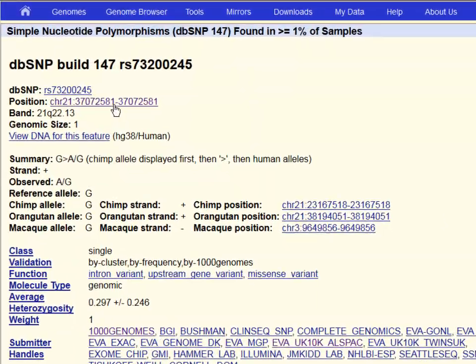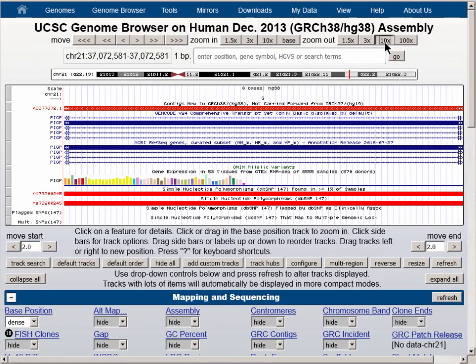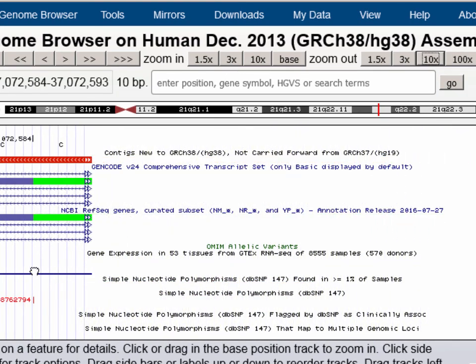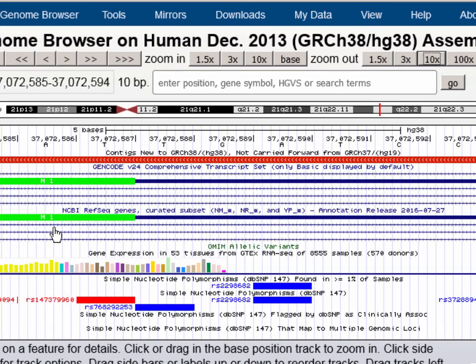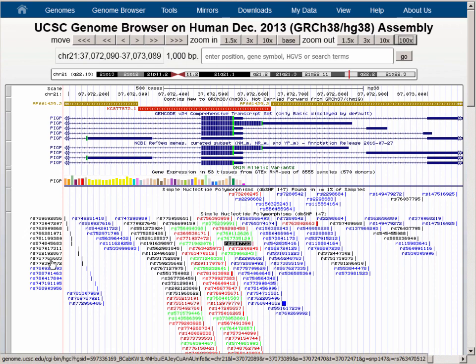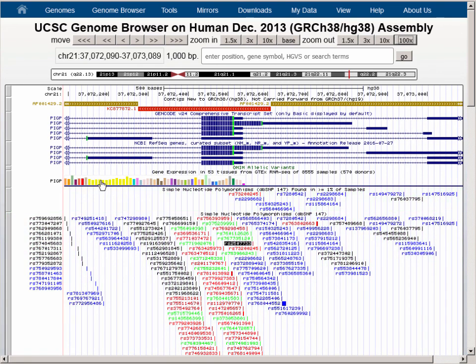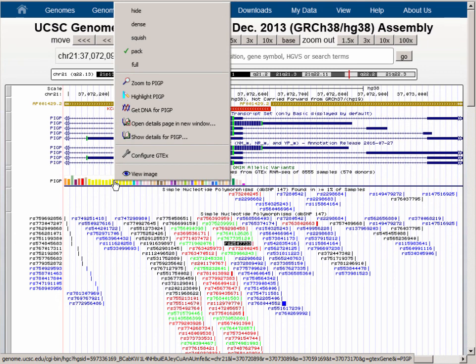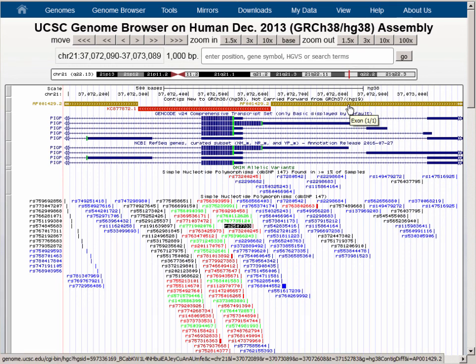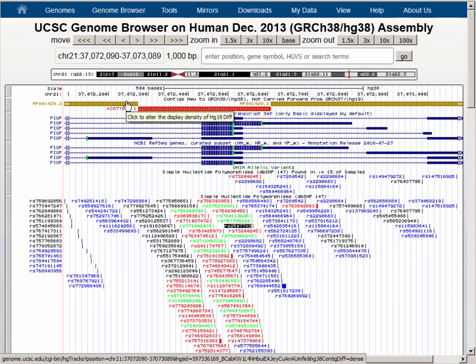If we click into the Position link at the top of the Details page and zoom out by 10x, we see that the proline is at amino acid 3 on the amino end of the protein. Zooming out by a factor of 100, the All SNPs and common SNPs tracks are more populated. Using the right mouse button, let's hide the GTX expression track. In the HG19 diff track you see the full extent of the clone colored red, and clones on either side showing some modification in HG38 relative to HG19 as well.